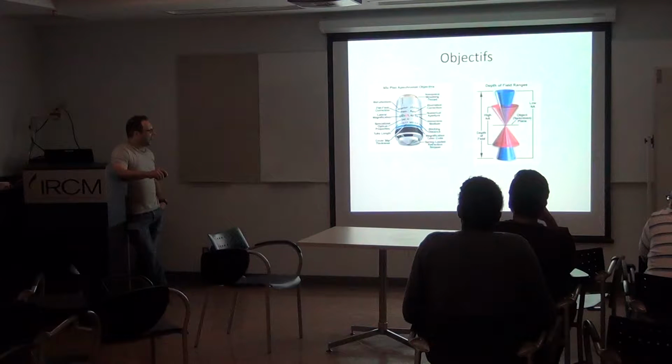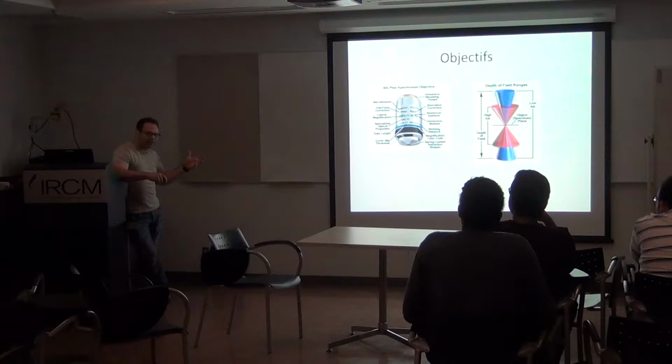Right after, you're going to find another number, which is the numerical aperture. I did say it was really important to remember the numerical aperture is a number which will give you the precision of what you can get as an image.